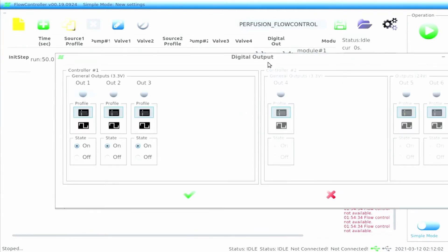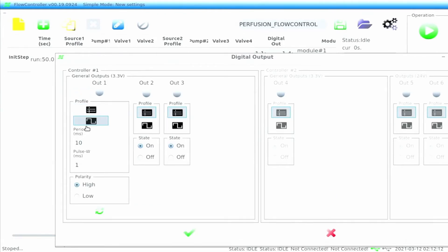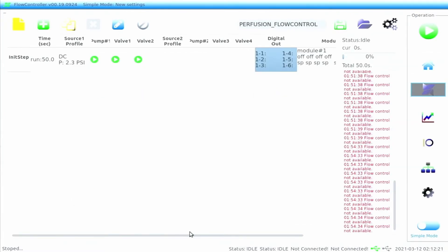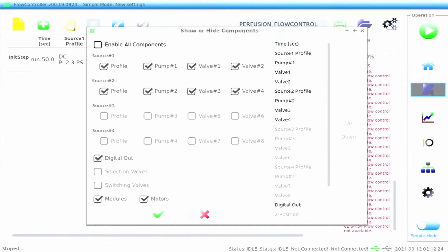Selecting the digital output cell lets users activate or deactivate a high voltage output. Turning the output on readies it, and turning the state on activates it. The user can also change the output wave profile. The settings icon in the top right allows users to enable individual components to be shown on the advanced mode screen.